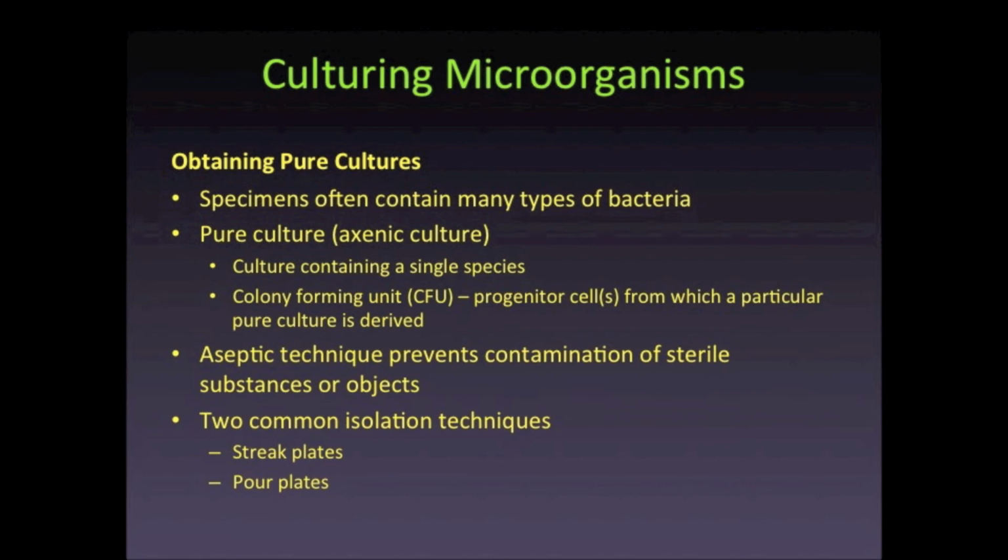Microorganisms are not visible with the naked eye and are ubiquitous, meaning that they are literally everywhere. These characteristics make the study of microorganisms very different from studying any other living organism. Microbiologists must use aseptic techniques when studying microorganisms to exclude unwanted microbes. A number of techniques are available to isolate a pure culture. We will explore two isolation techniques, the streak plate and pour plate techniques.